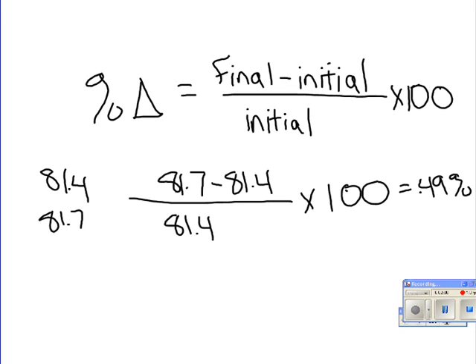So what you need to do now is take some time and calculate the percent change in mass for all of those. I can tell you this: at 0, what's the percent change in mass? 0. Yep, but otherwise it should get bigger for egg 1, and it should be negative for egg 2. Why? Because in egg 2 your egg lost weight, so if you subtract a negative number, you're going to get a negative. So for eggs 2 and 4 you should get negative numbers for percent change, and for eggs 1 and 3 you should get positive numbers.